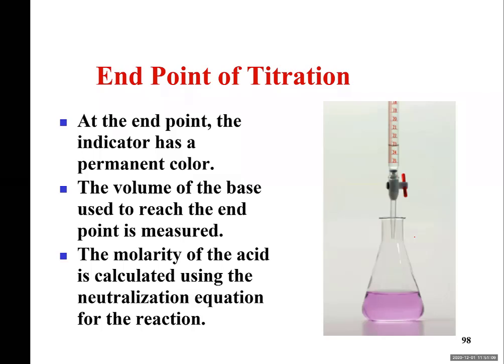So the endpoint, that means the end of titration, is a point where you have a very light pink which remains constant, is not changing immediately. Sometimes it remains for 60 seconds and that's long enough. It doesn't go back clear instantly. As I said, all we are doing is asking how much volume of sodium hydroxide is needed to get to the endpoint. That means to consume all the acid in vinegar.